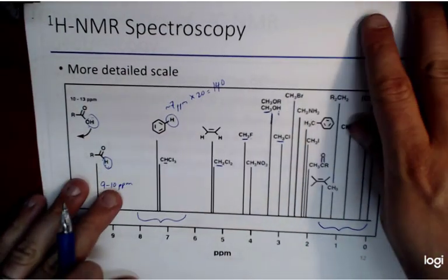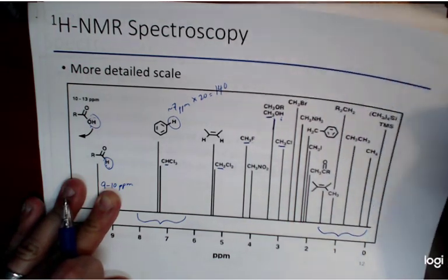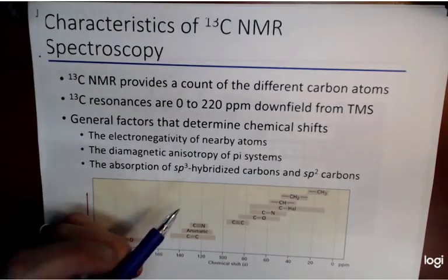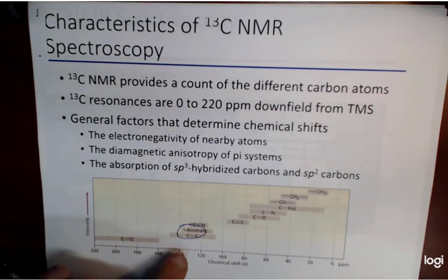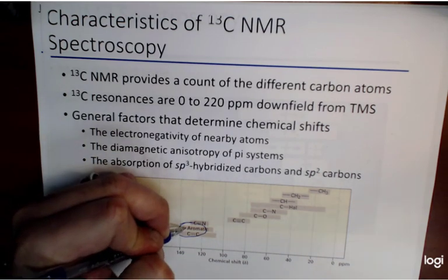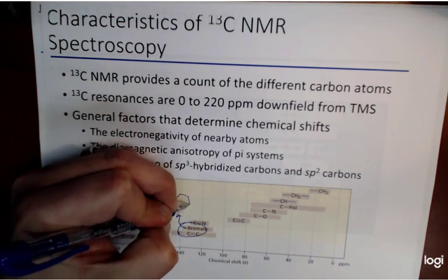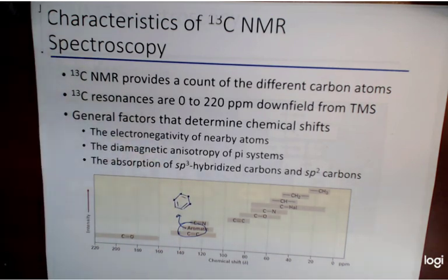Okay, so now let's look, where are benzene ring carbons going to be found? Aromatic carbons, benzene ring, right? They're right in there around the 120 to 140 range. So aromatic, though, that's these carbons, okay? That's those carbons on the ring, okay?